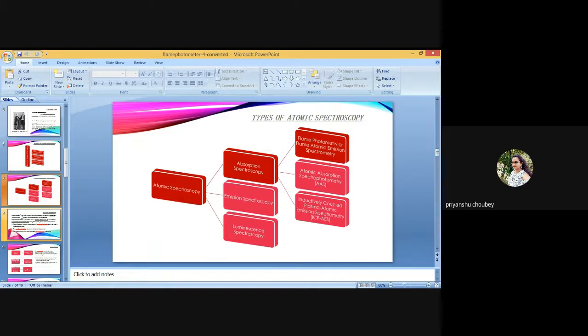If a nitrous oxide acetylene flame is used, first ignite an air acetylene flame and then change over to a nitrous oxide acetylene flame. Turn on the main gas supply from the cylinder, followed by the fuel control knob of the instrument, and light the flame immediately. Adjust the fuel control (acetylene) and support control (air or nitrous oxide) knobs to produce the required kind of flame, air acetylene or nitrous oxide acetylene.